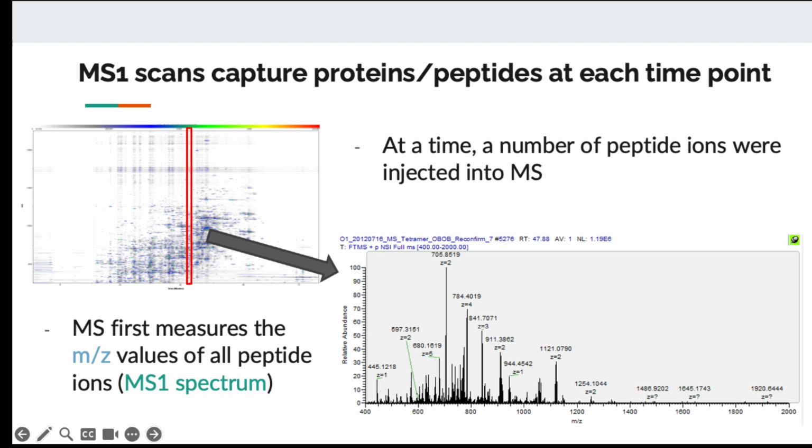So one of the assumptions that people make, because we have no idea if these are peptides, proteins, or contaminants, is that because we are analyzing protein, the exact protein from the sample, we expect protein and peptide to be the most abundant in the data.